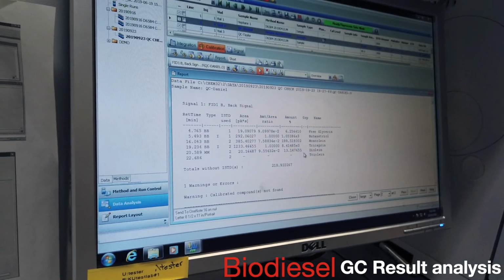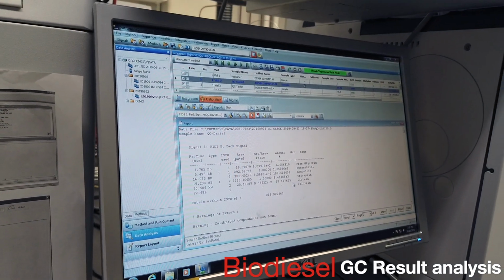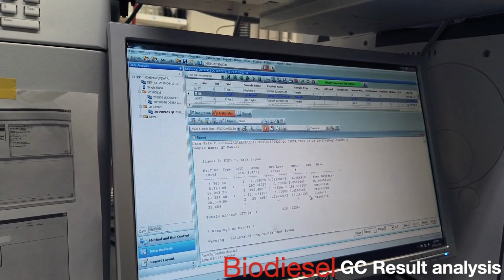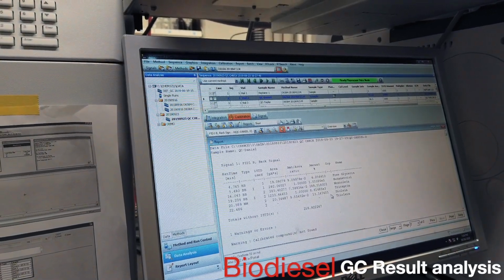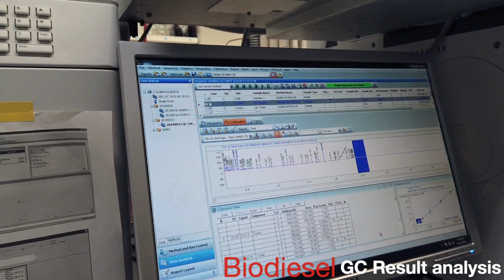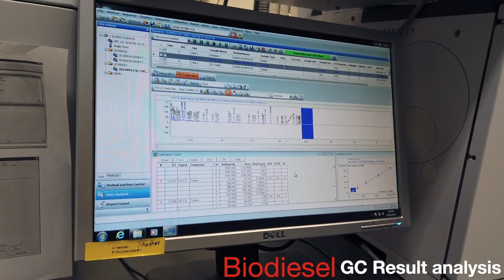Okay, so what happens if you take out the third point for the free glycerin in here? Do we get closer? Because this was 0.005 and we would be at 0.006. Yeah, which is really close, pretty tight. I can mess with it. At this point I just want to have something. That's great. I'm glad I could be helpful.